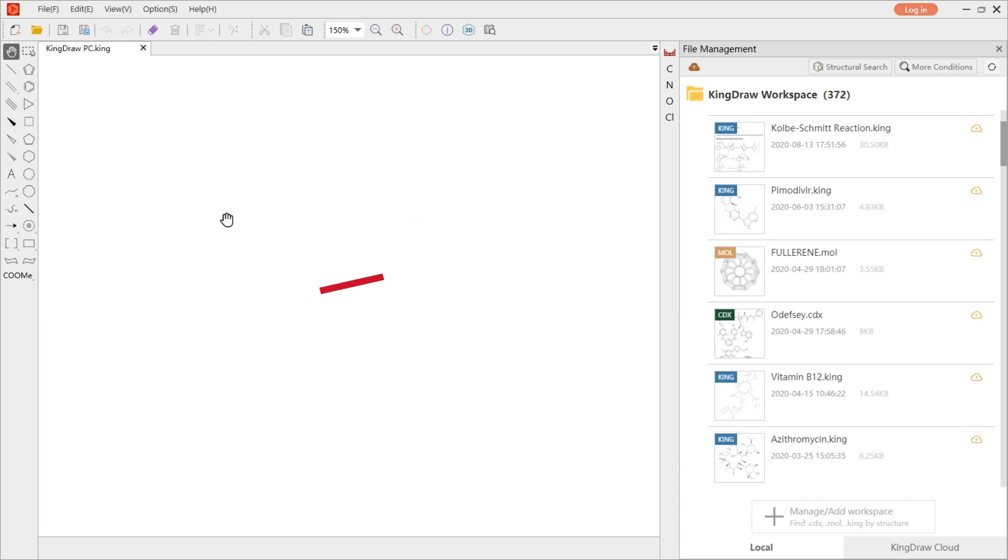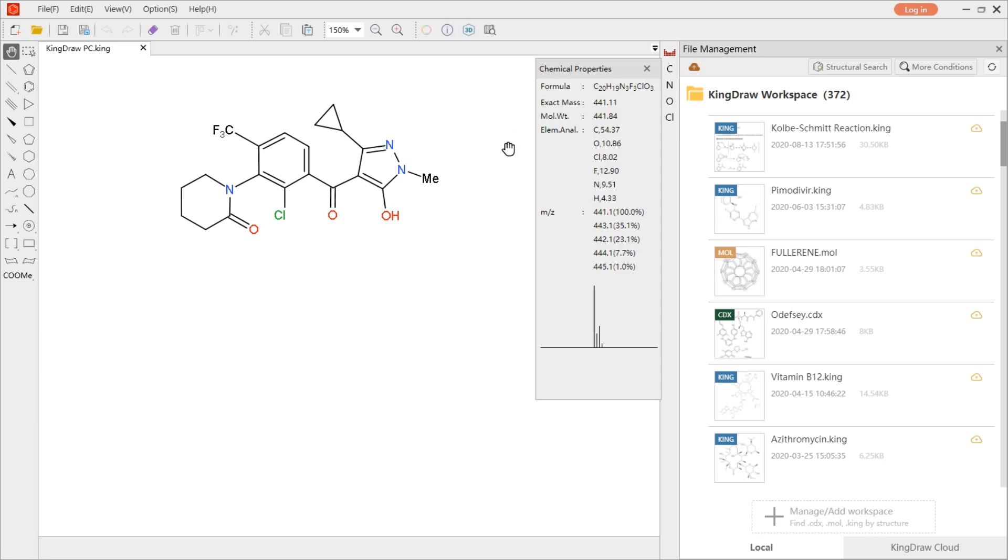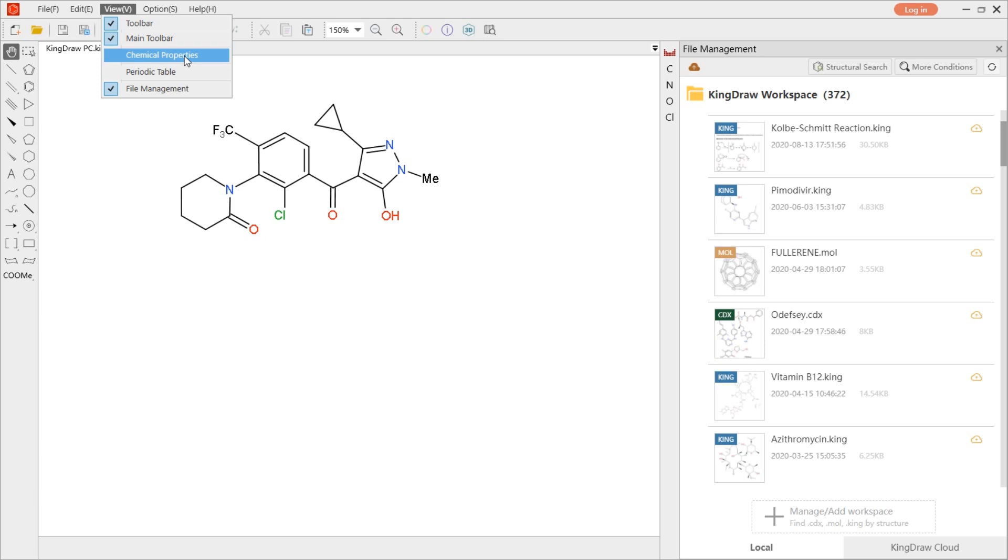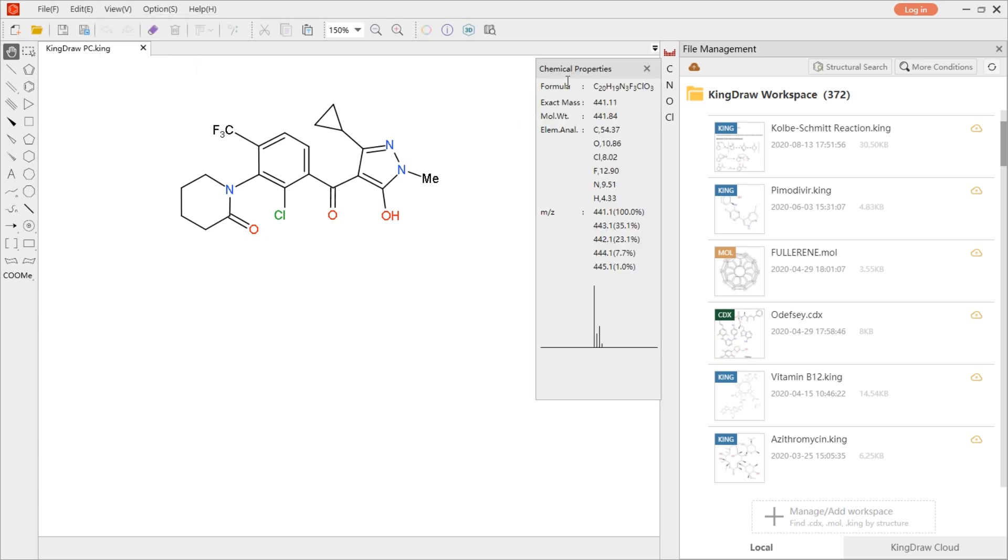For convenience, Kindle provides a one-click view of chemical properties. You can click the chemical properties button in the top toolbar or click the chemical properties in the view menu to open the window. It can be moved at view.